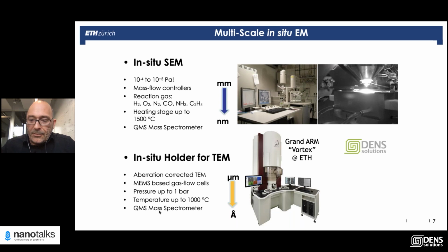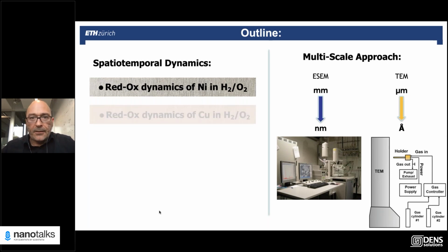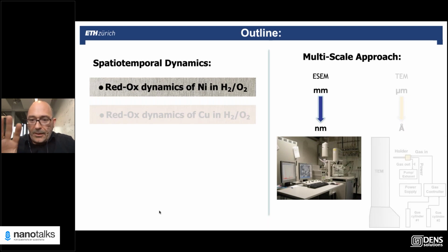And I would like to show you some simple examples of what we have studied with this combined multi-scale approach between SEM and TEM. So we take simple systems that are hopefully still understandable under catalytically relevant conditions, and we compare what we see in the SEM and what we see in the TEM. I start with nickel, and I start with the SEM, and then I go to the TEM.